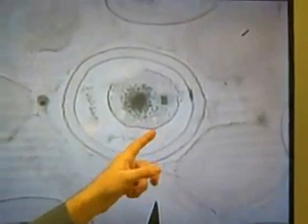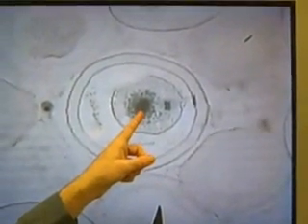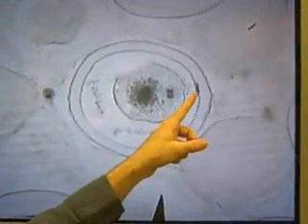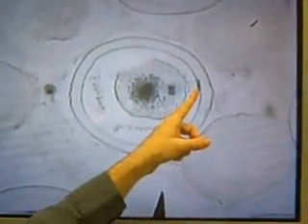This female, there's an egg. You can see the sperm nucleus. So the sperm is already in the egg. You can see the first polar body is right here. It's on the outer rim of the shell. Here's the second polar body. So the Ascaris produces two polar bodies. The purpose of those two polar bodies is to remove excess chromosomes, so the egg cell can go from being diploid to being haploid.